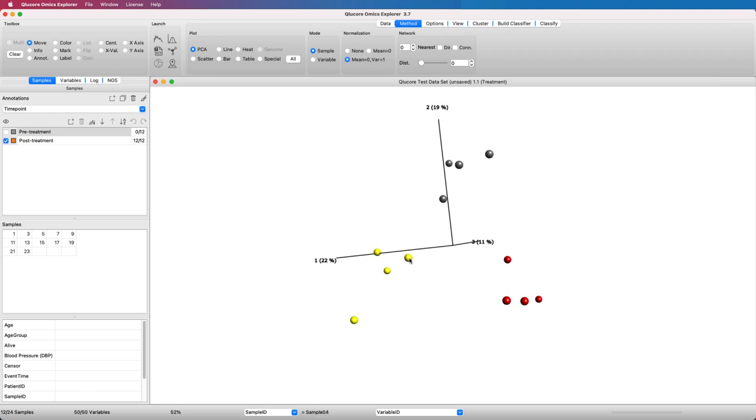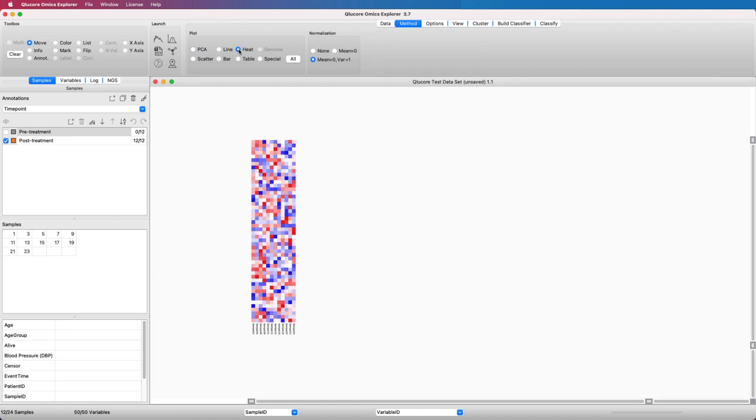Choose the preferred plot for the visualization. The PCA plot, as well as the heatmap plot, is good to use. In this example, we will change to a heatmap in the Method tab.